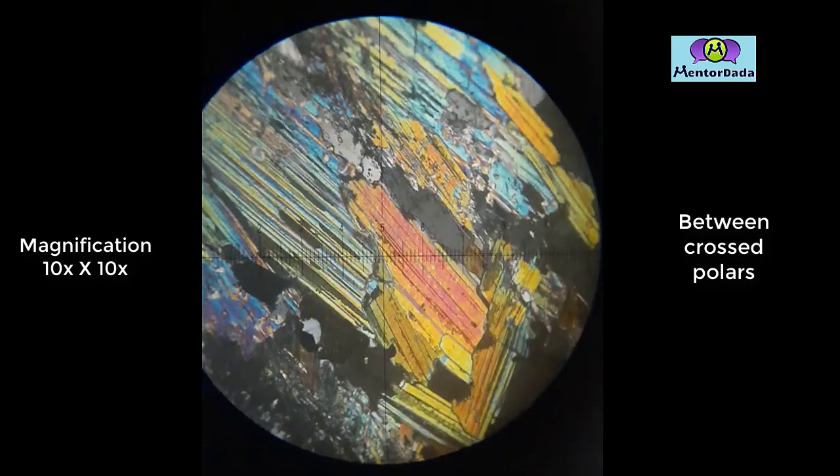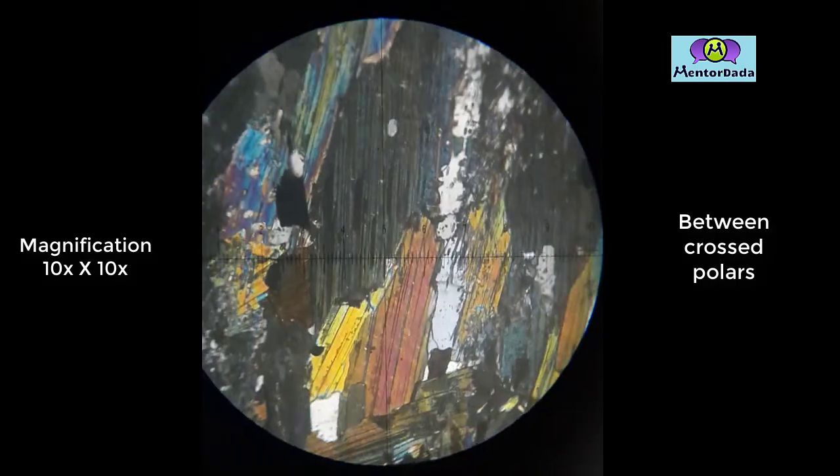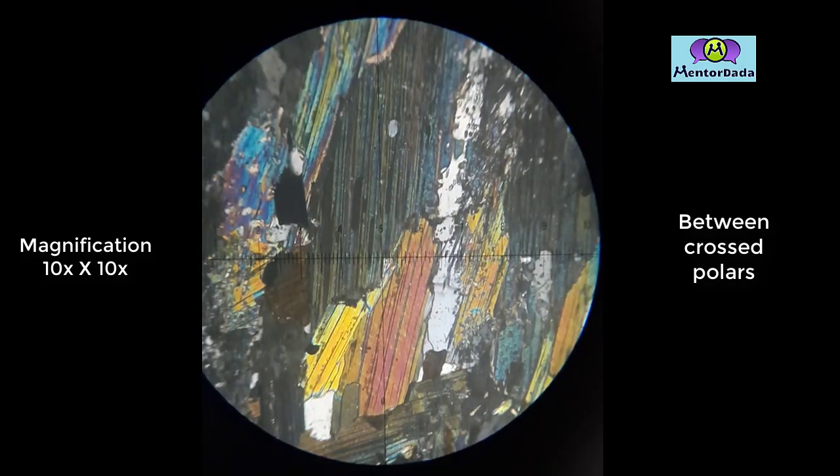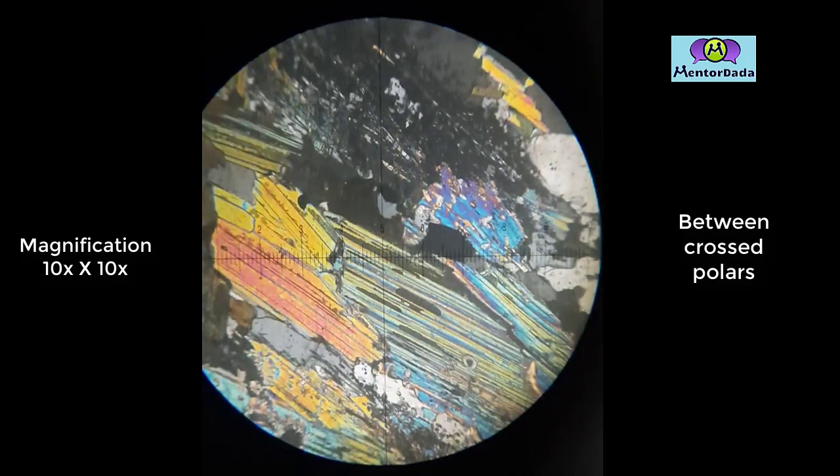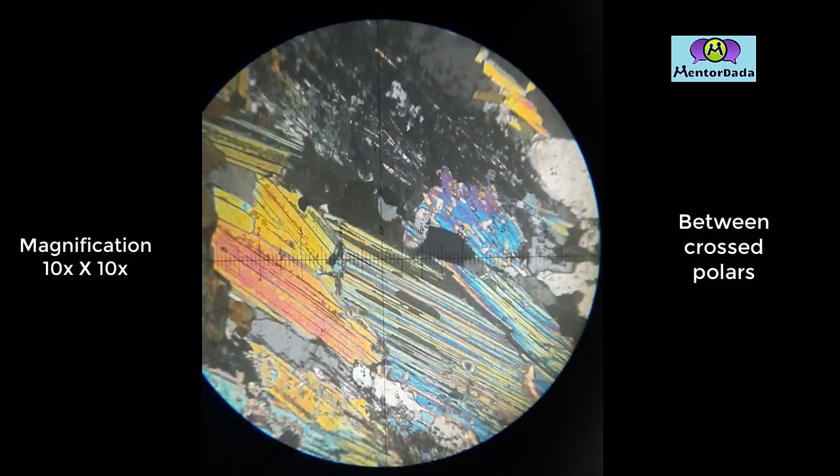Interference color is second order to third order, anomalous or variegated interference color. Bi-refringence is quite high.